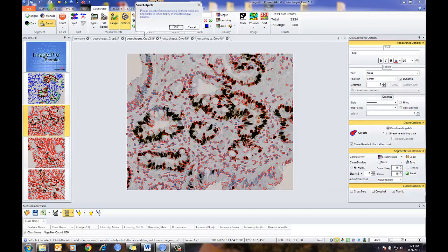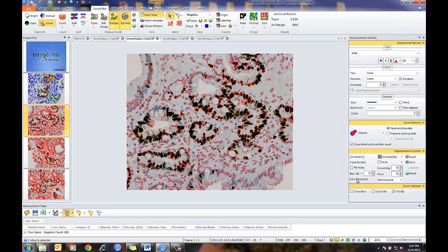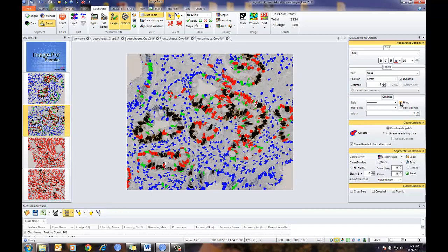If I want to add some more positives, I can simply go through the same scheme. If I make a mistake, I can continue — I can always select and delete it afterwards. I'll pick another one or two, press OK, and calculate classifiers. It updates the weighting and refines it. I can press OK and it will update the classification scheme. Turning filled on and off, you can see how well it's doing. I can keep refining and working on the same image until I'm happy with my classification scheme.